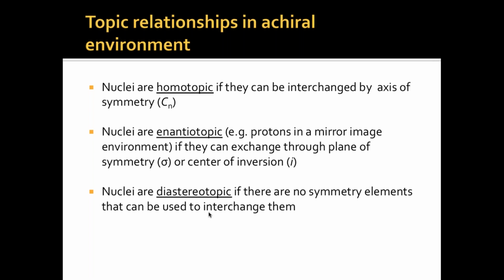Enantiotopic, everybody knows what an enantiomer is, the protons are in a mirror image environment. Diastereotopic, no symmetry elements.